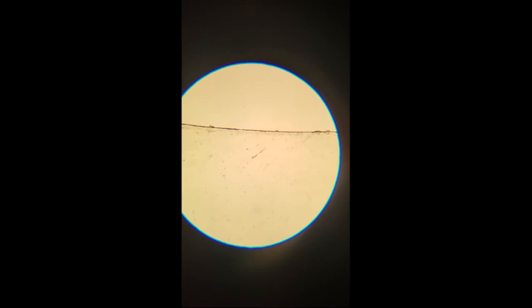Due to inversion, if you want to move an object in one direction in the microscopic field, you must move the slide in the opposite direction on the stage. I hope this presentation was insightful.